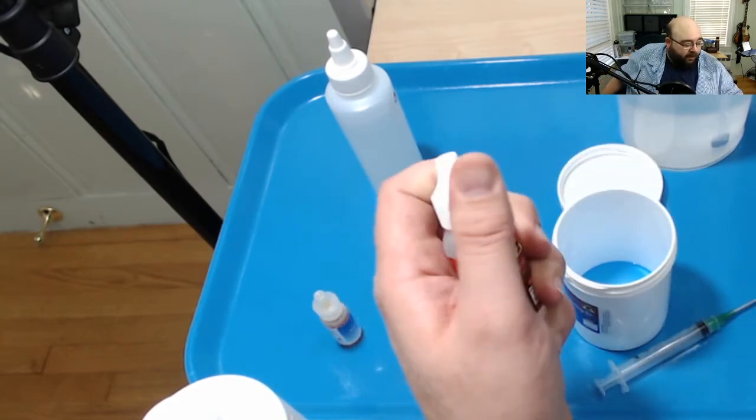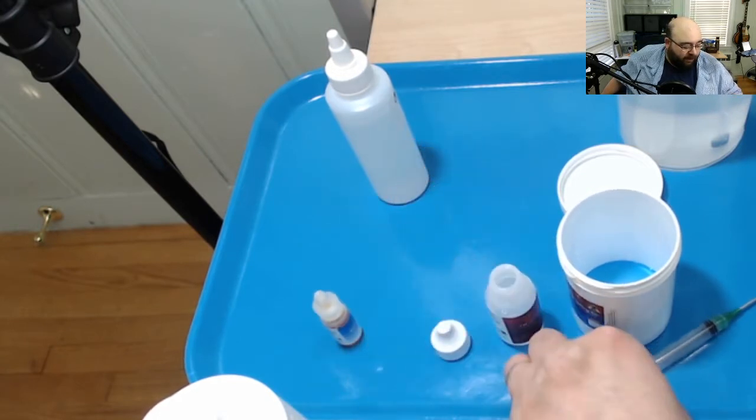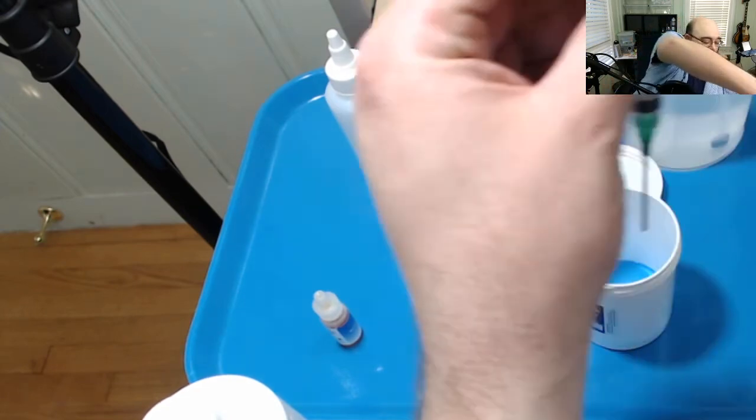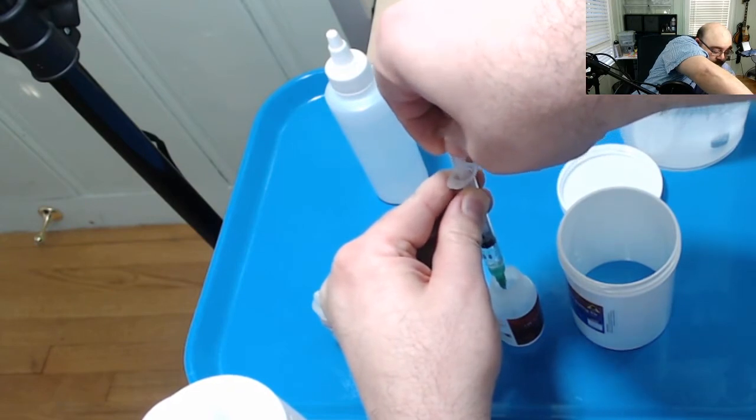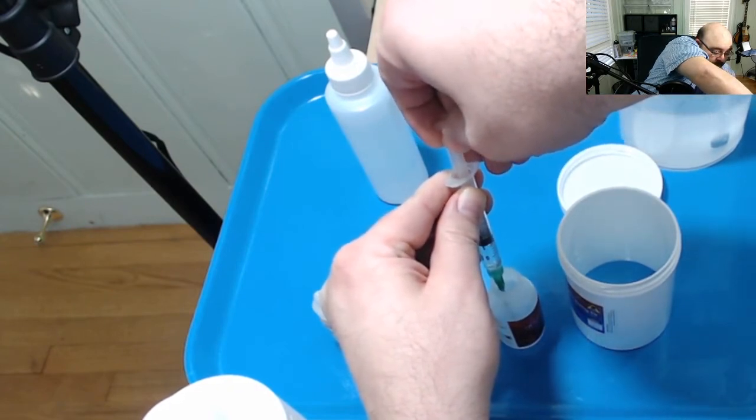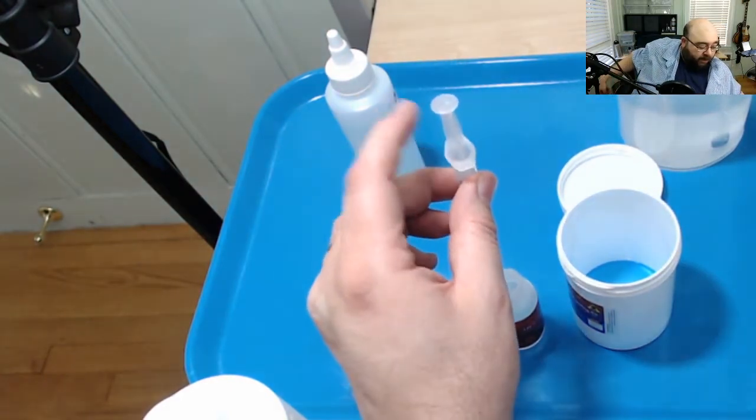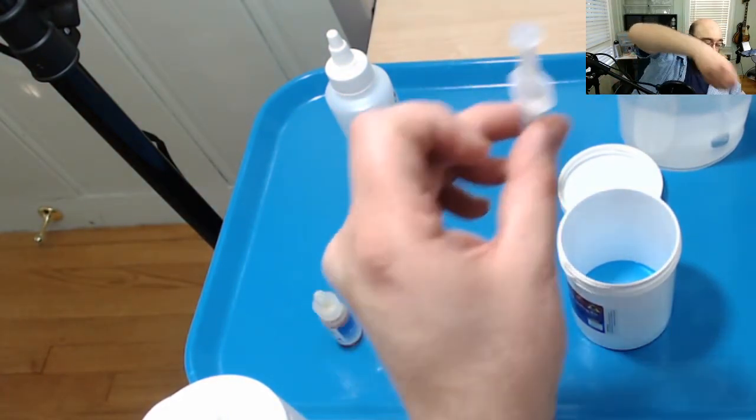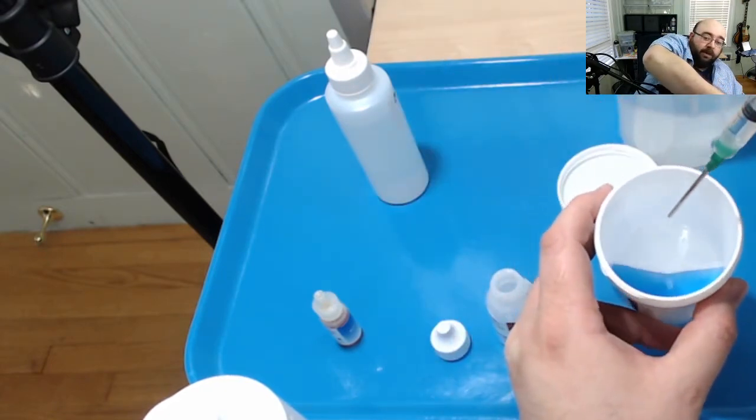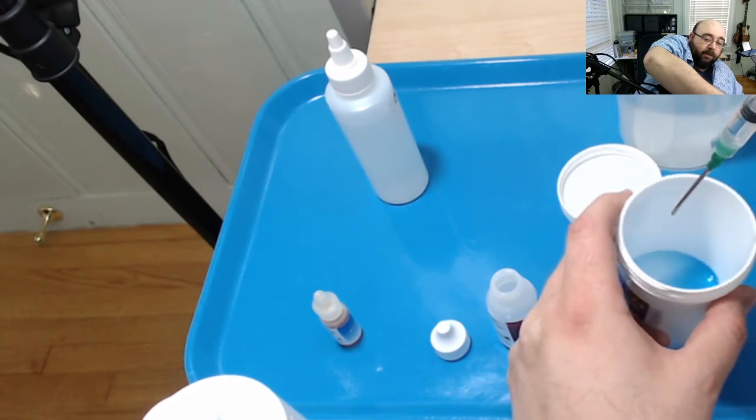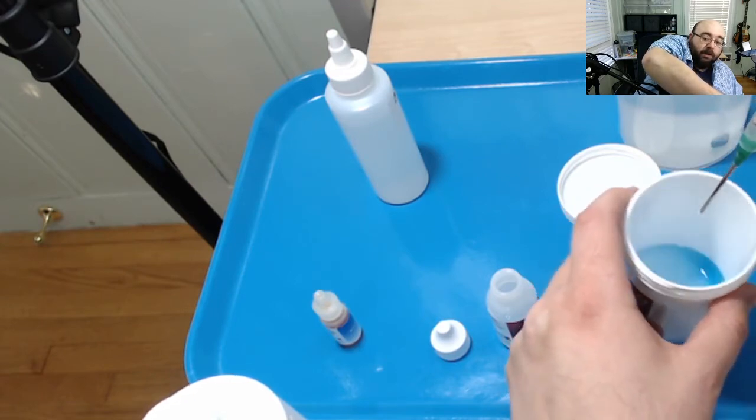So I'm going to take out the acid. Probably shouldn't be handling this with one hand, but I'm doing a video. And I'm going to draw out about one mil. And we want it to be exactly one mil. And then what we're going to do is drip it into here slowly while mixing it. So you can see it's still blue. Still blue.